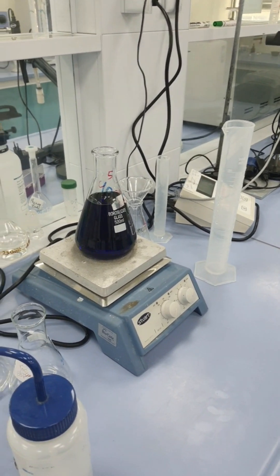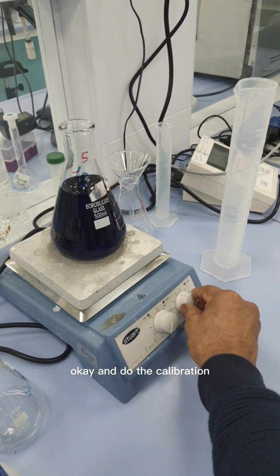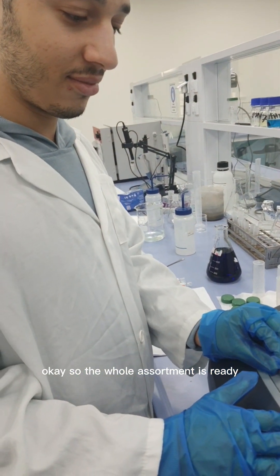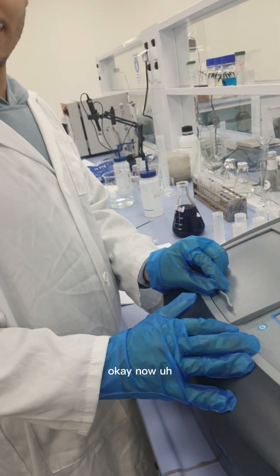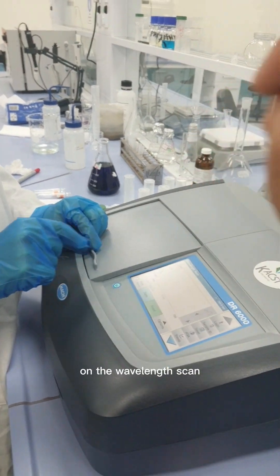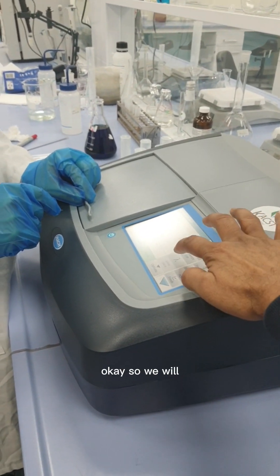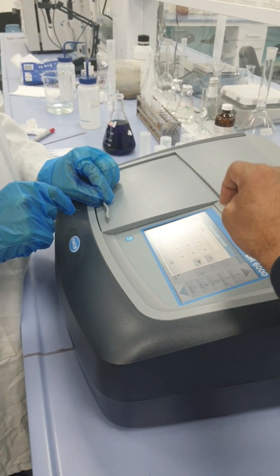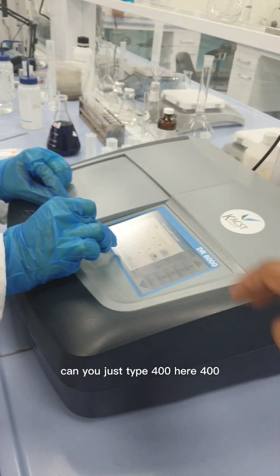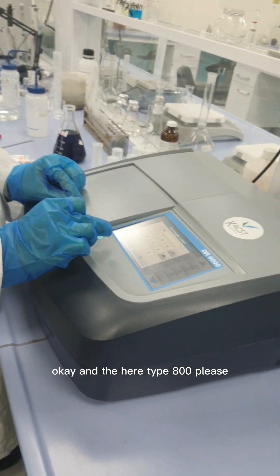After that we will do the serial dilution and proceed with the calibration. The stock solution is ready — this is our methylene blue. Now the second task is to click on the wavelength scan. We need to change the wavelength range: type 400 for the lower end and 800 for the upper end.